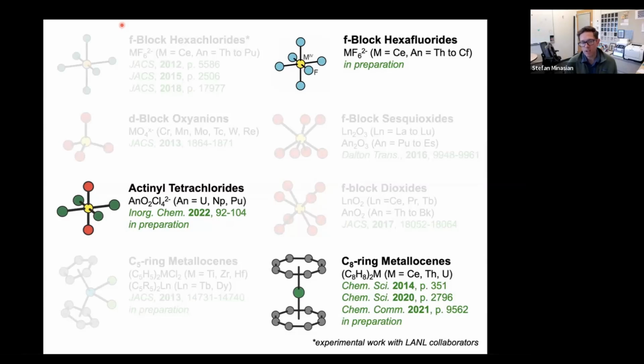One of the disadvantages of working at such a low energy is that you have to have the optics right up next to the sample. And so this really limits the kinds of sample environments that you can have. But when you go to higher energy, you can accommodate things like solution cells. You can do in situ electrochemistry. And so I can imagine that this hard X-ray technique would really open the door to all kinds of more exciting techniques that we can't really do with these very soft energies.